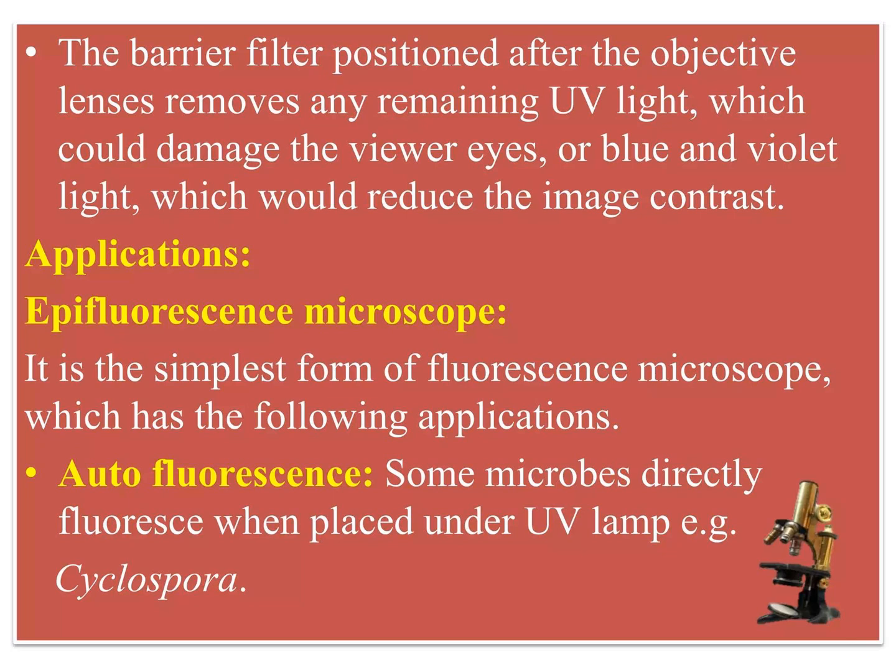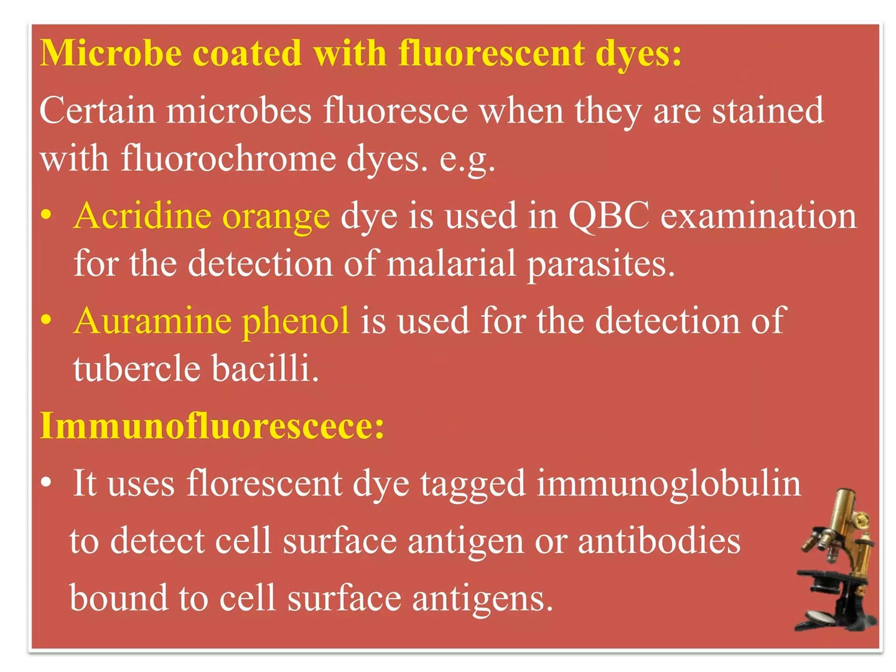Application: epifluorescence microscope. It is the simplest form of fluorescence microscope, which has the following applications. First one is autofluorescence. Some microbes fluoresce when placed under a UV lamp. An example is cyclospora. Microbes coated with fluorescent dyes: certain microbes fluoresce when they are stained with fluorochrome dyes.